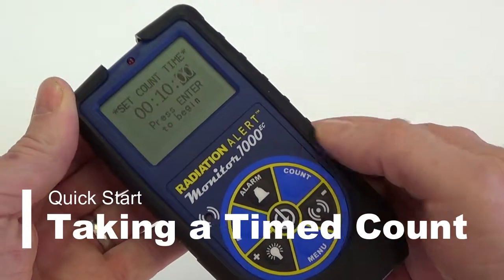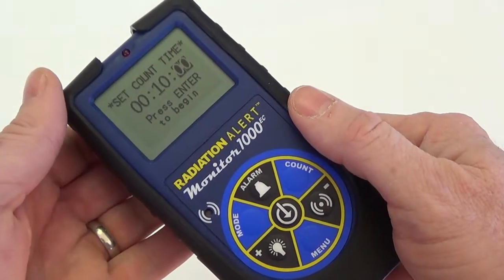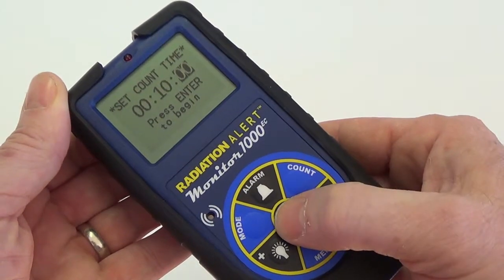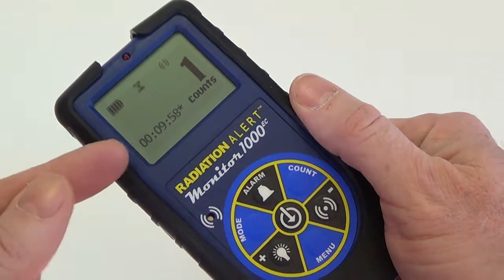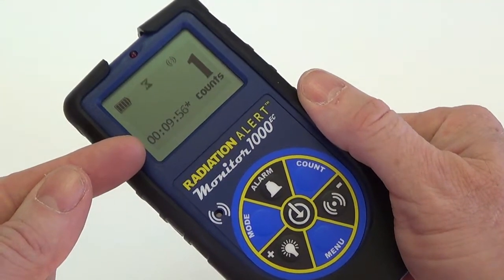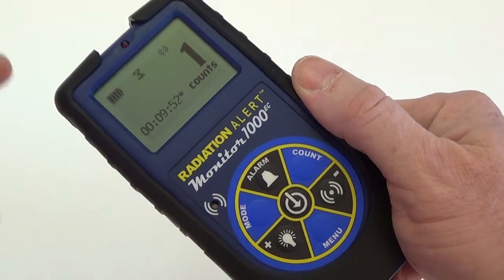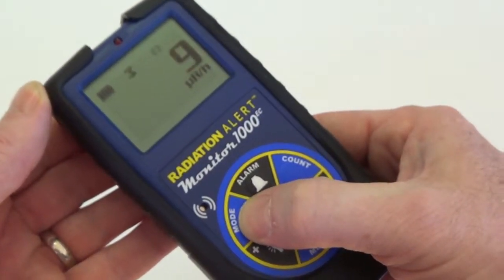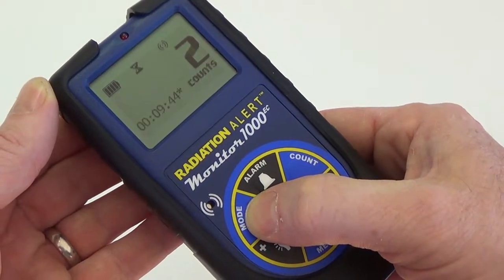To perform a timed count, press the count button. This will take you to the set count time screen. Use the plus and minus buttons to set your desired count time, then press enter to begin your timed count. The countdown will appear in the lower left-hand portion of the screen, and a flashing hourglass icon will appear at the top of the display. You can scroll through the various modes while taking a timed count, and continuing to scroll will bring you back to the count screen.